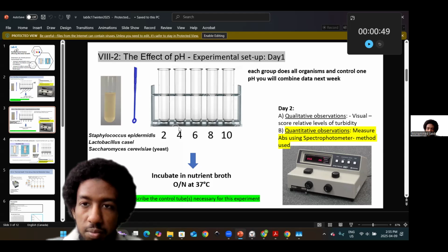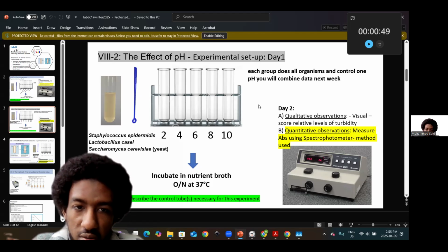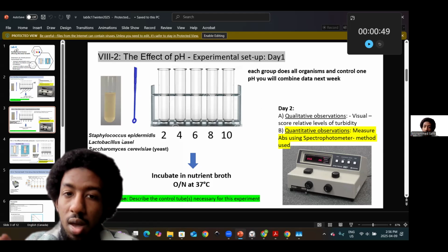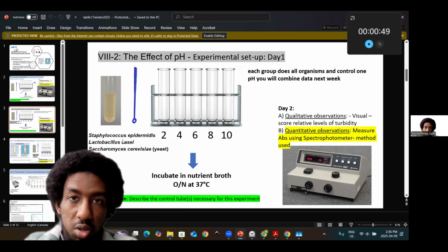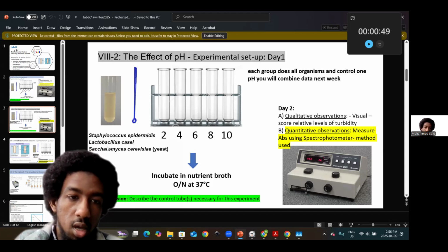You have essentially all of the ranges, and consider the growth and, as I mentioned, the lactobacilli. Think about the different bacteria that you would have likely used and connect the dots with their applications and implications that you expect from the results, and understand how you can best reason and predict the results accordingly, from what you expect.